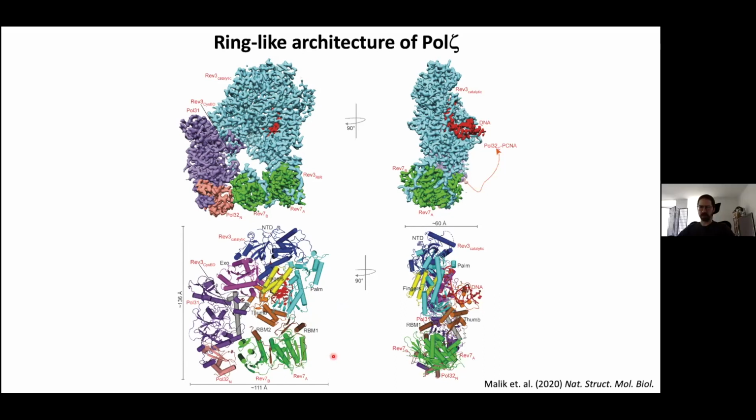Thank you. Another chameleon-related question. Can you say which protein concentration you used for chameleon grid freezing, and is that in the normal range for what you'd use without the chameleon? So we did have to use about 10 times higher concentration than we use normally for our grid preparation. I was doing around 0.2 to 0.3 mg per mL for my normal grids, but for chameleon we had to go to almost 1 mg per mL to get a decent data set with the chameleon grids.